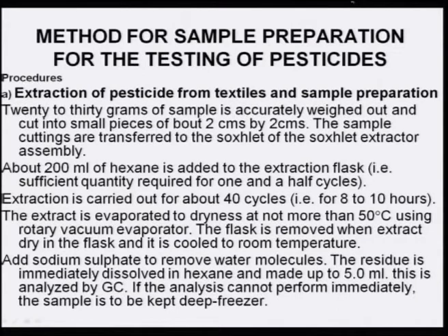If the analysis cannot be performed immediately, the sample must be kept in a deep freezer, because pesticides are liable to get decomposed at higher room temperature. So, they need to be preserved.